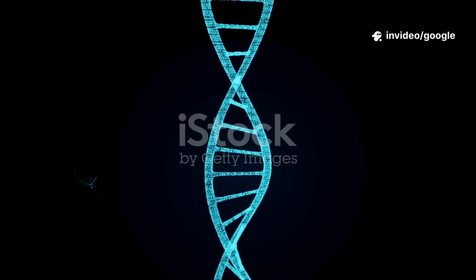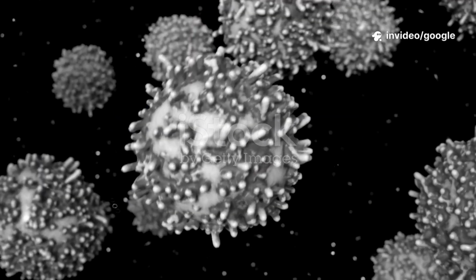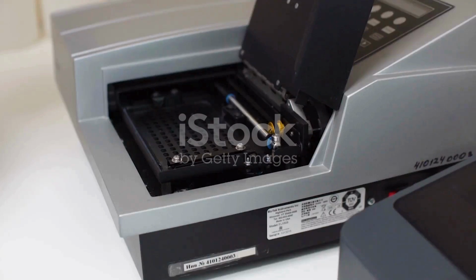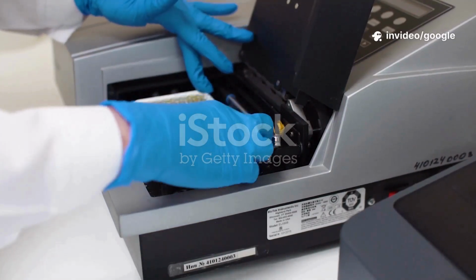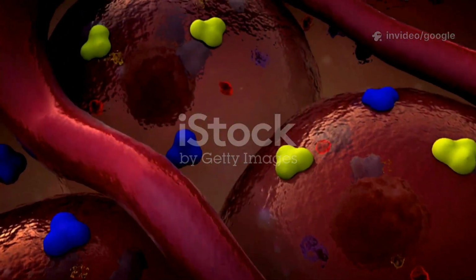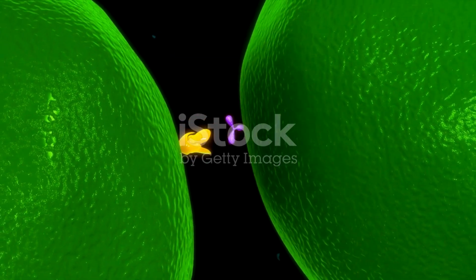4. Delivery of the CRISPR-Cas9 complex into cells. Once the RNP complex is formed, it needs to be delivered into the target cells. Common methods include electroporation, nucleofection. These physical methods use electrical pulses to create temporary pores in the cell membrane, allowing the RNP to enter the cytoplasm and then the nucleus. This is a highly efficient method for RNP delivery.